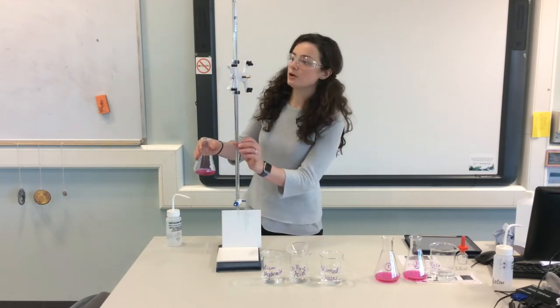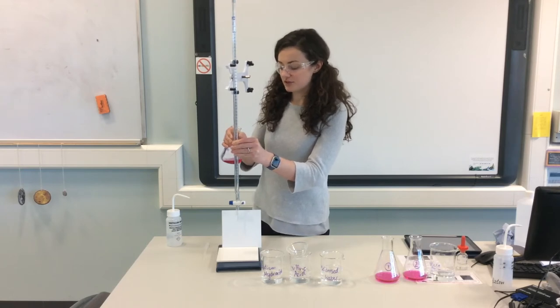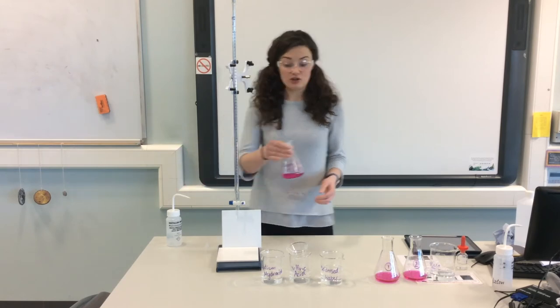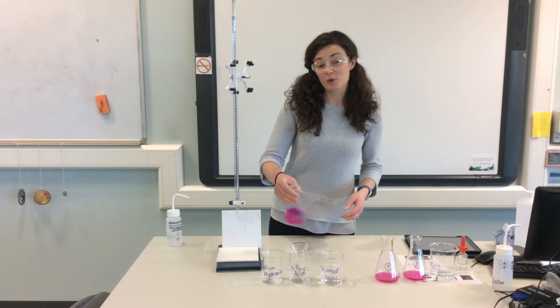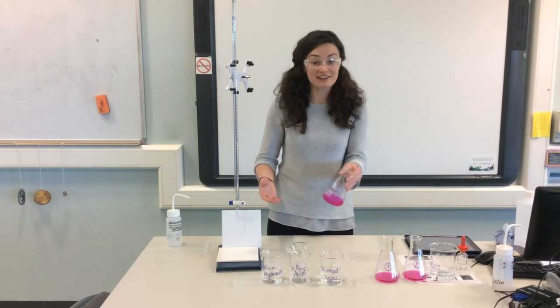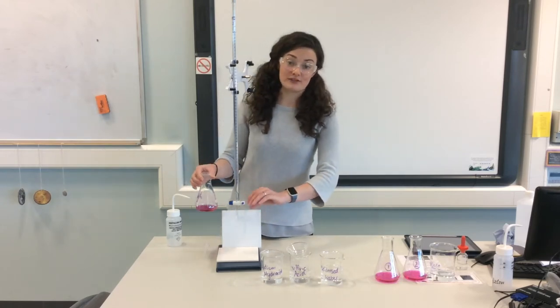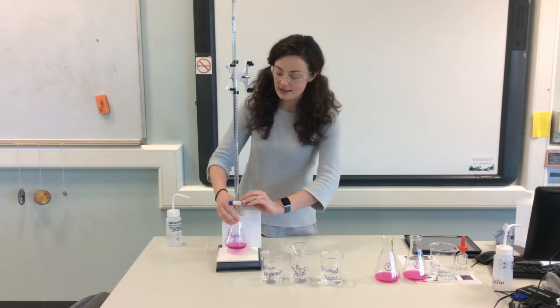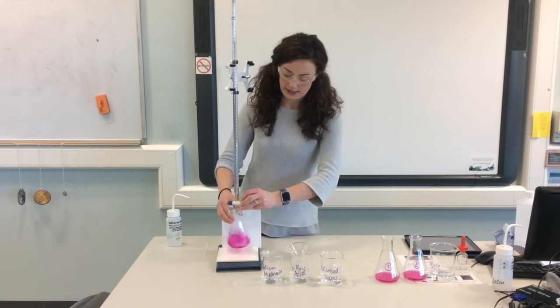Generally, in terms of manoeuvring this, I'll turn this around. I'm not sure whether you'll be able to see numbers or not. In terms of using the burette, we tend to hold the conical flask in your writing hand. I'm right-handed, so I'm holding it with my right hand here. That's because it's easier to swirl with the hand you write with. If I try to swirl with my left hand, for some reason, it just doesn't seem to work too well. Then you operate the tap with your non-writing hand. So I'm going to put this underneath the jet of the burette, and we'll just open up the tap to add the sulfuric acid in.